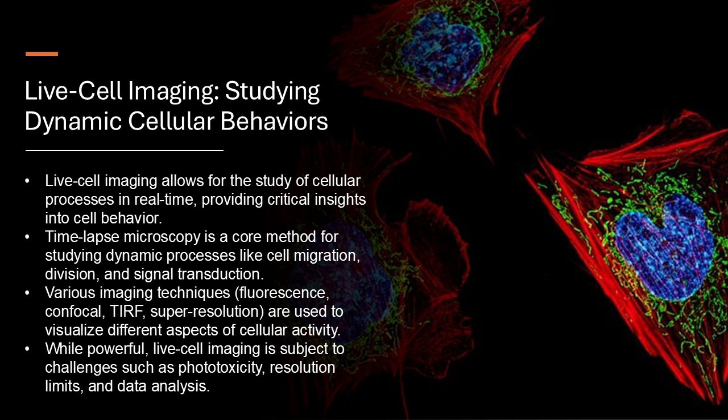Exactly. And with live cell imaging, we can begin to decipher these complex communication networks that govern tissue development, function, and repair. We can see how cells interact in real time, how they influence each other's behavior, and how they work together to create the amazing complexity of a living organism. That's incredible. It feels like we're on the verge of a whole new era of understanding in biology. I think so too.